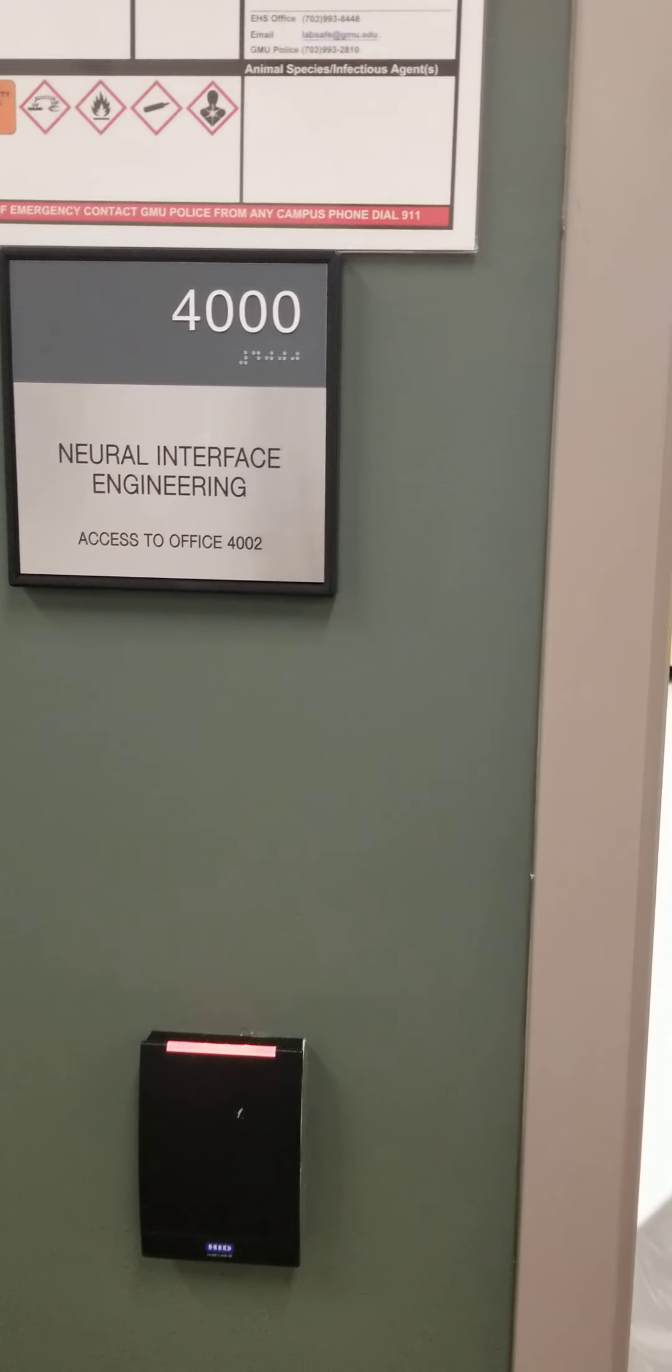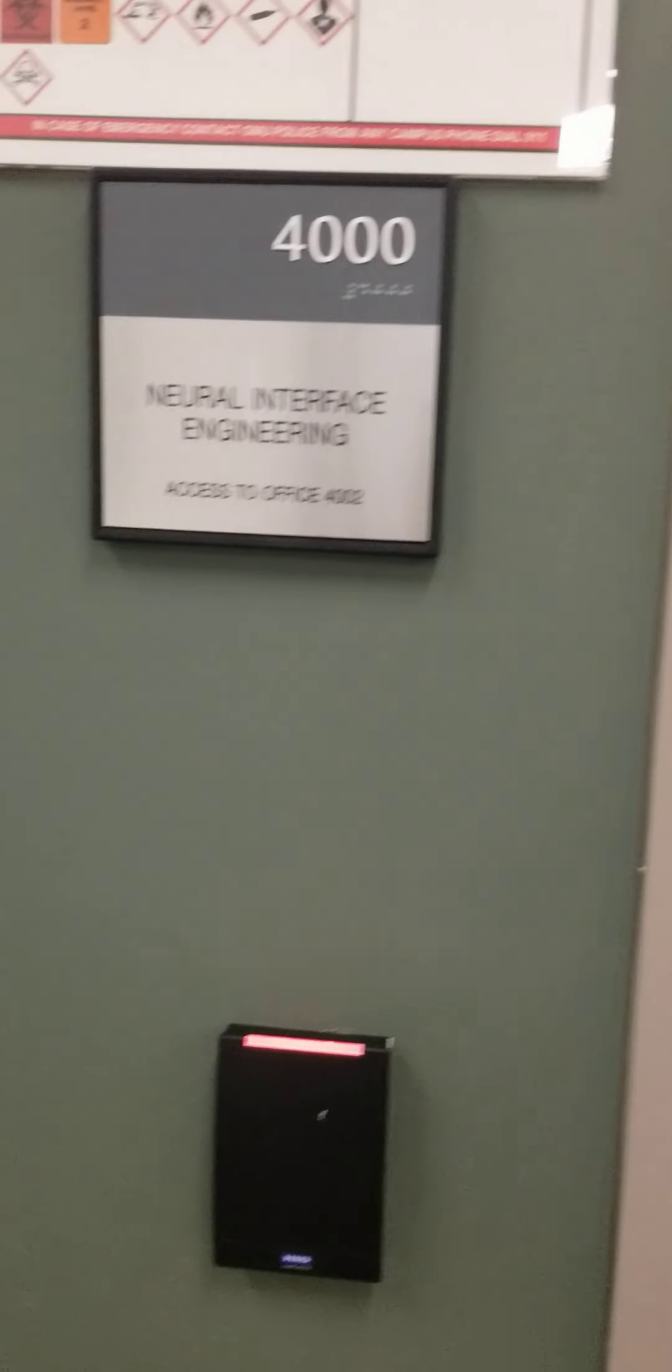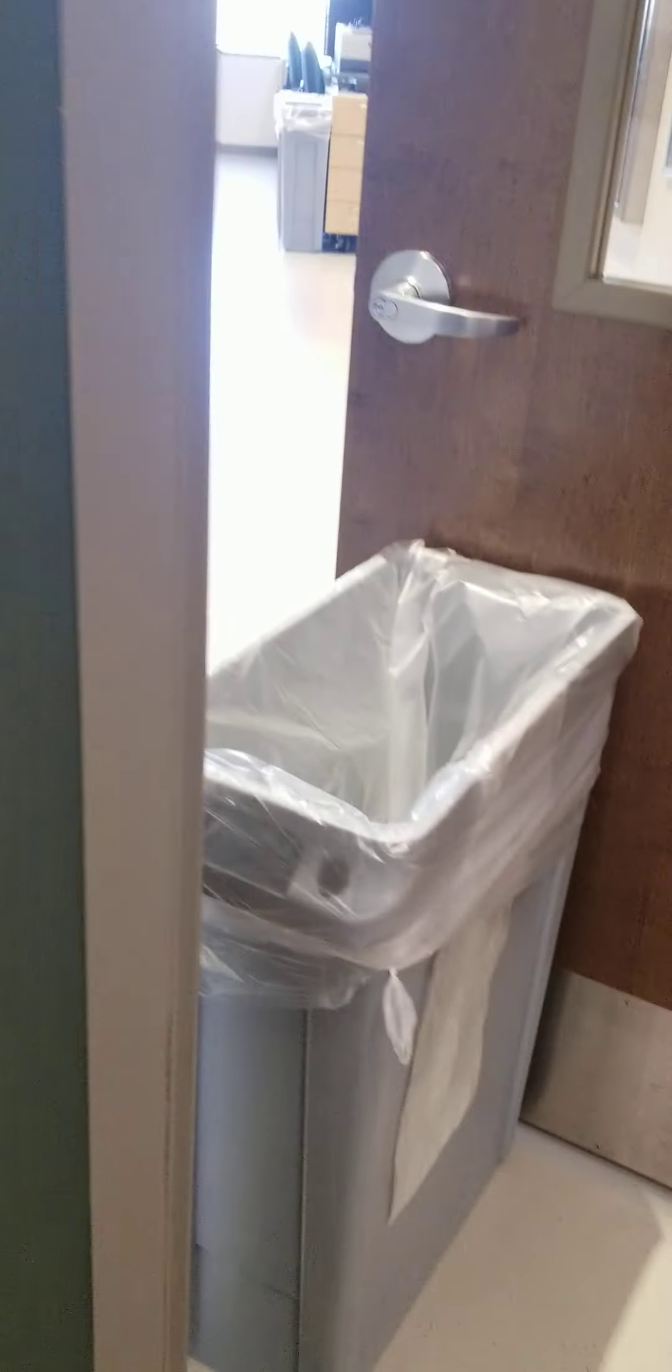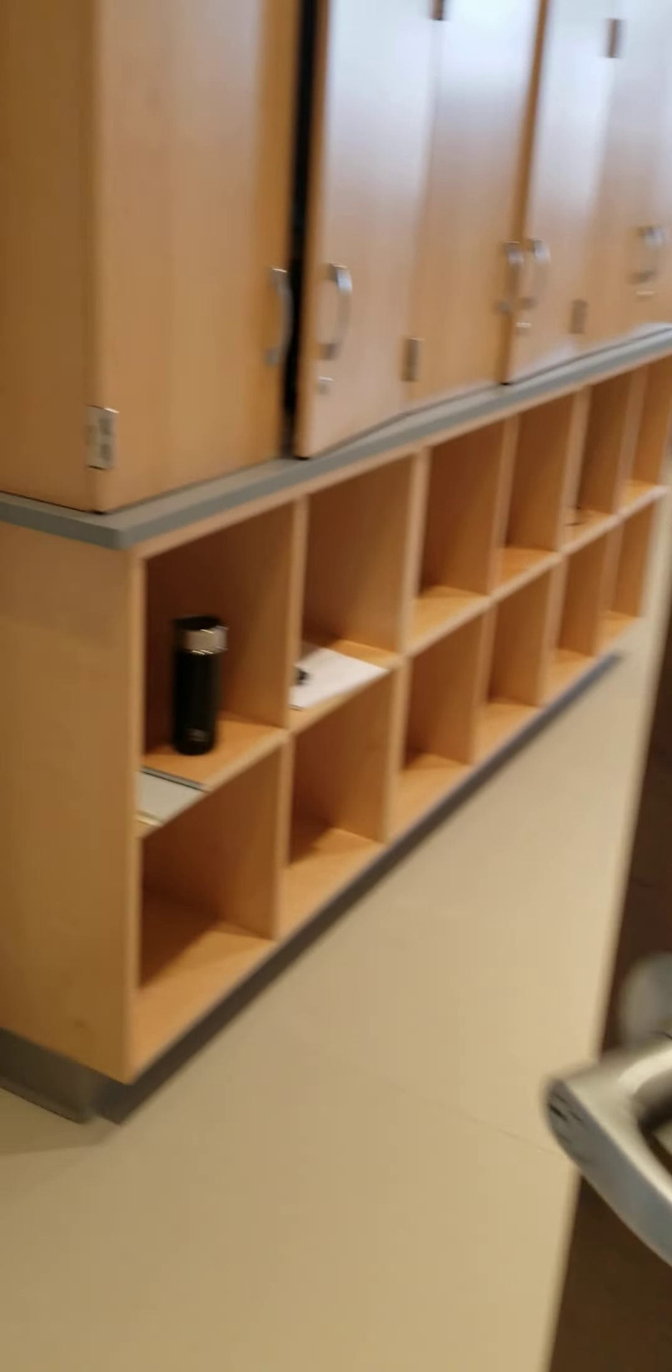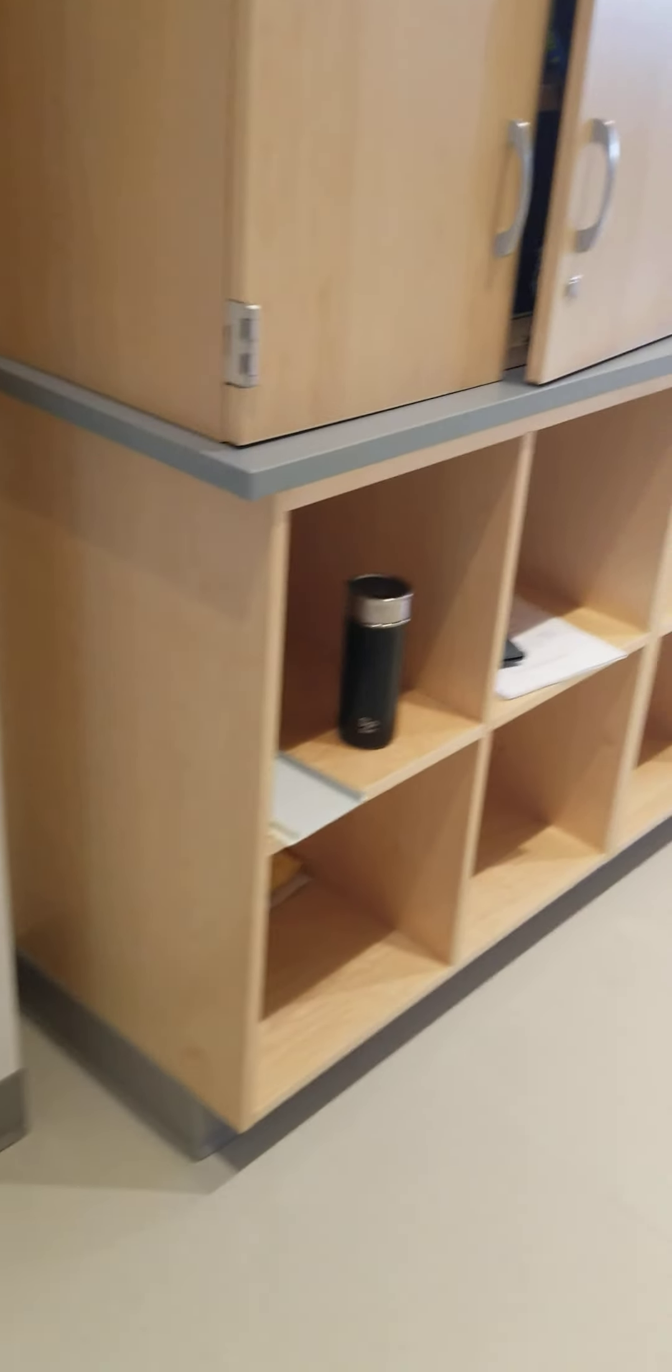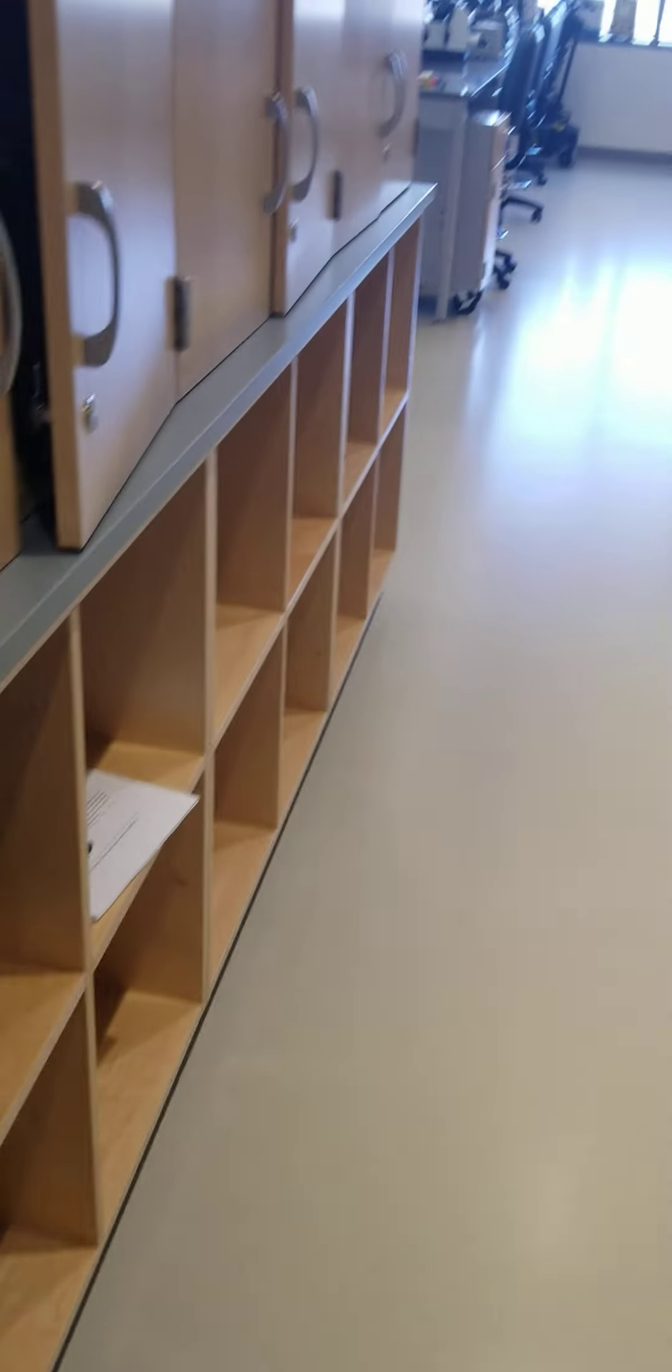Okay, this is a video about the lab. It's room 4000 of Peterson Hall and this door is usually locked, but hopefully I'm gonna be in here.